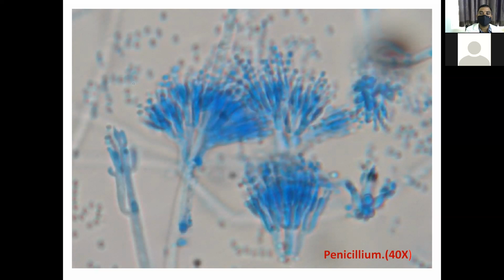Then you have to focus first in the low power objective. Then if you see the entire structures clearly, you go into 40x high power, and these can be seen. Close the condenser down and you will see this.